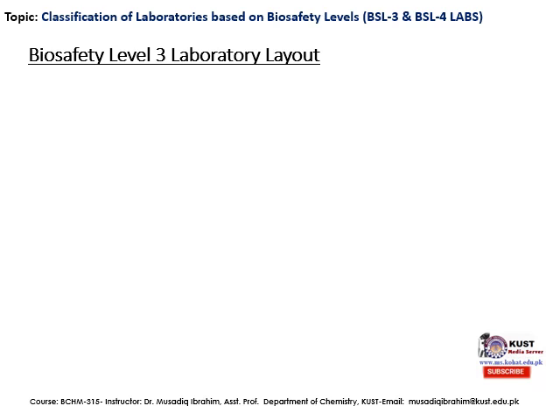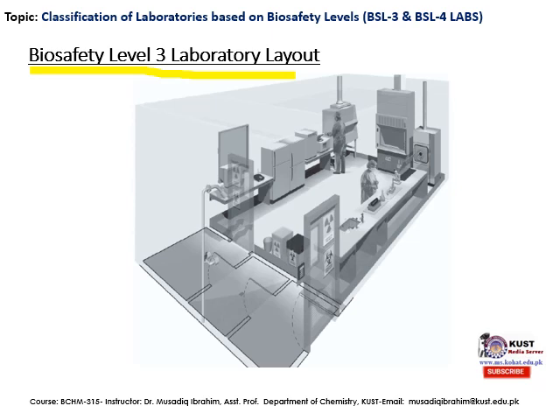Now moving towards the biosafety level 3 laboratory layout. This is the BSL-3 laboratory general layout, in which you can see that there are certain additions in comparison to the BSL-2 lab. All windows in the BSL-3 lab must be sealed, and the autoclave should be present inside the laboratory, while in the BSL-2 lab the autoclave was present outside the laboratory.